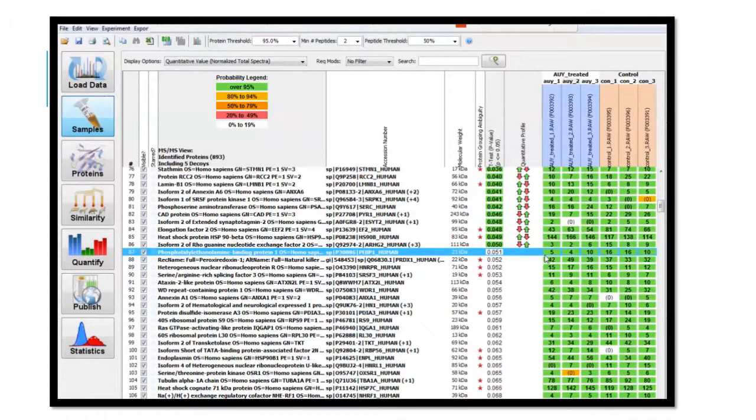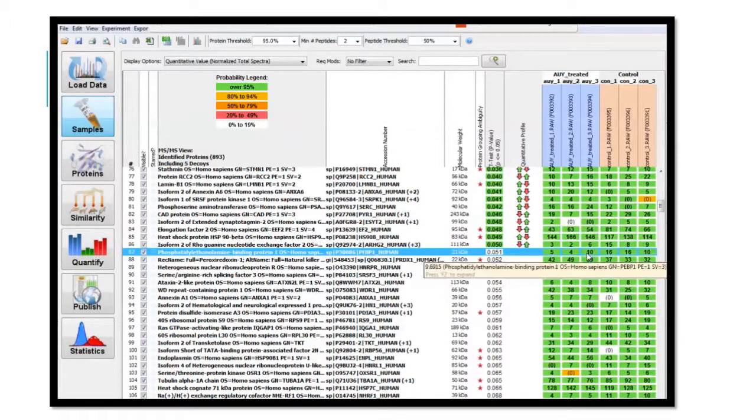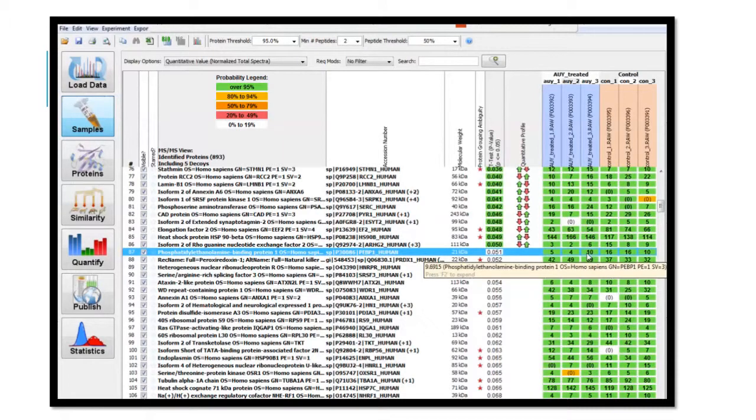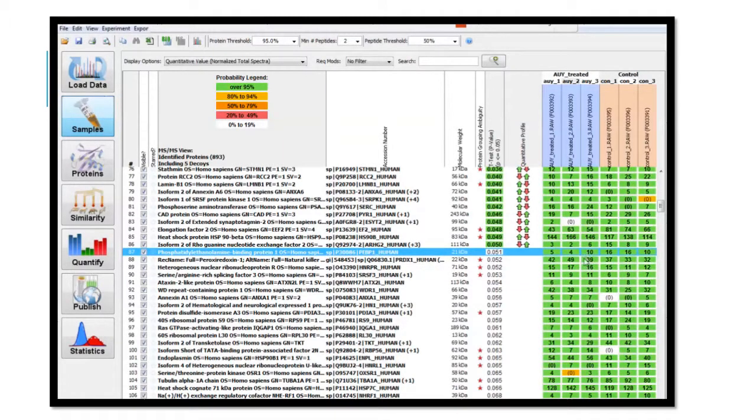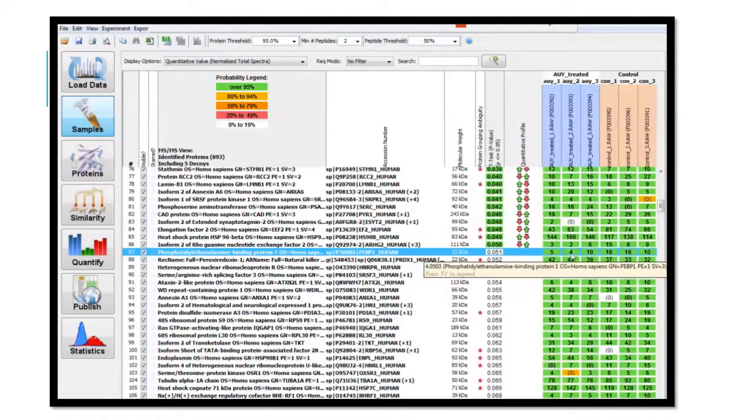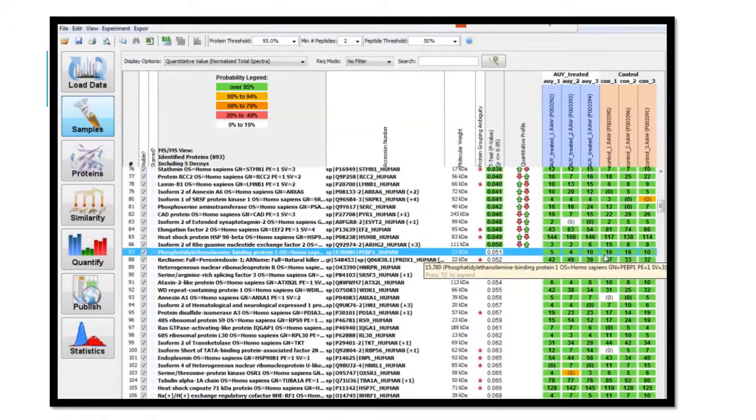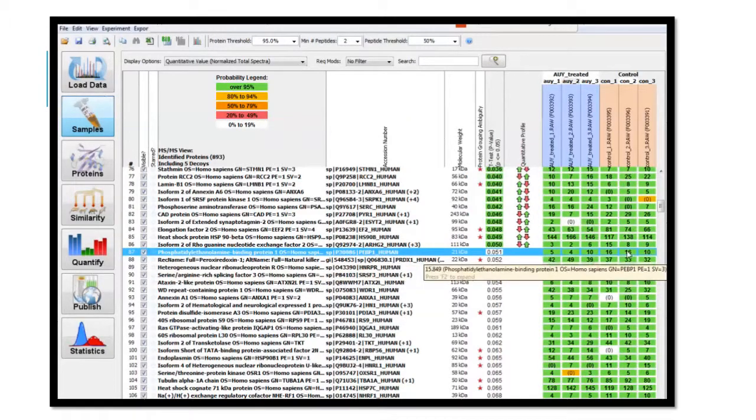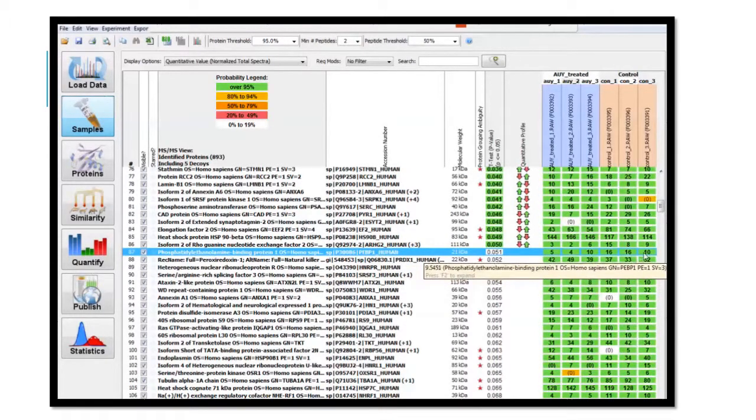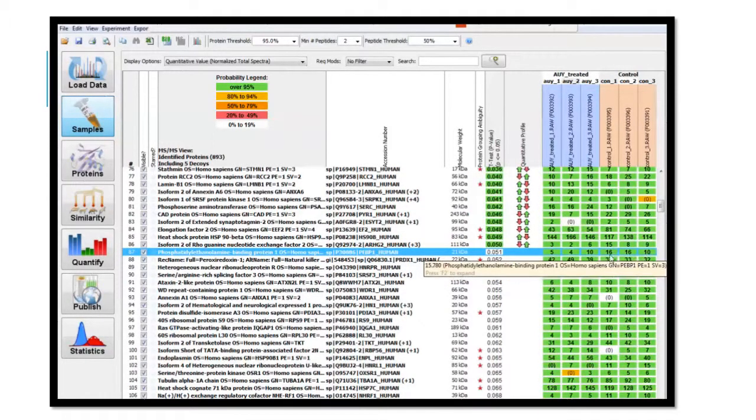Comparing the treated versus control data, I can see that the treated cells have values of 5, 4, and 10, while the untreated cells have levels of 16, 16, and 10.